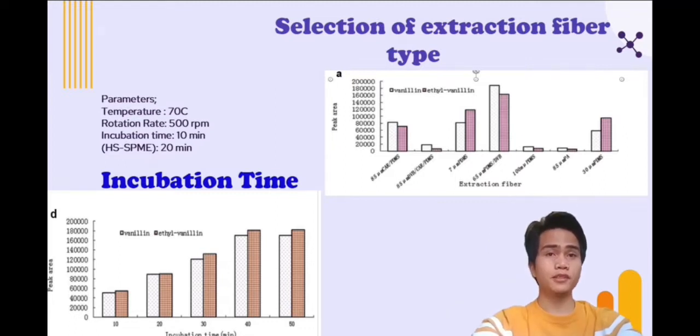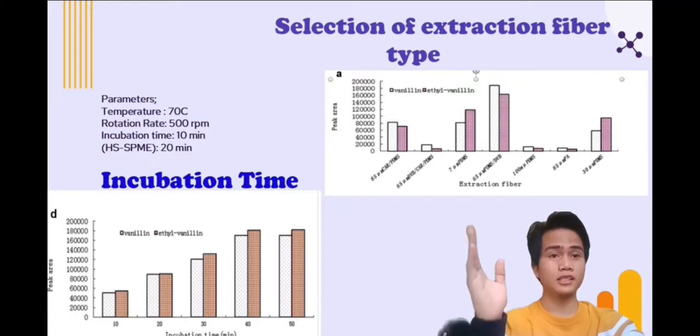And for the incubation time, the vapor-liquid equilibrium was achieved by preheating the sample. When other parameters were kept invariant, the peak area change of vanillin and ethyl vanillin at incubation time of 10, 20, 30, 40 and 50 minutes were studied. The experiment results are shown as above.